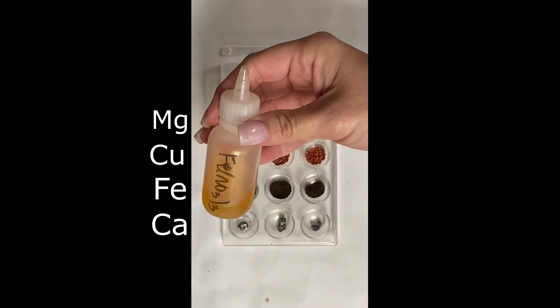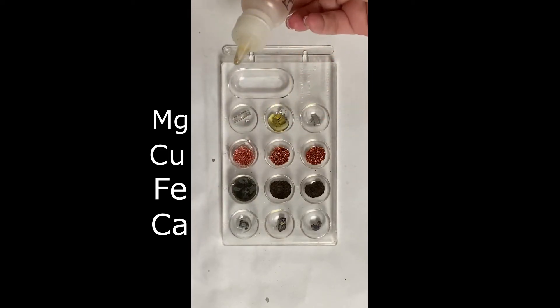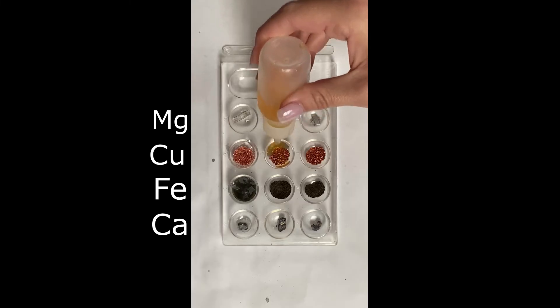Let's go ahead and do our second one. This is going to be iron three nitrate or ferric nitrate, and we're going to go ahead and put a little bit in each well.